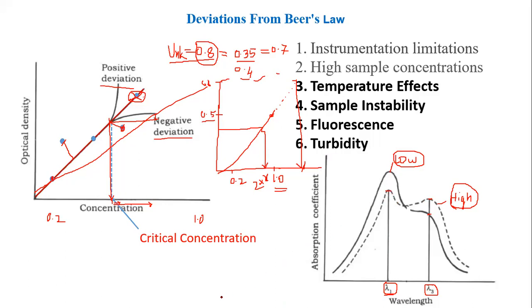Now I want to find out the concentration of my sample, which is an unknown solution of the same compound whose graphs are given over here. The concentration of my sample is not known to me. At what wavelength should I check in order to find out the concentration of my unknown? Is the point clear? Yes, sir.